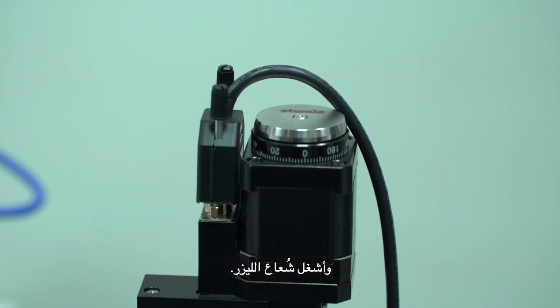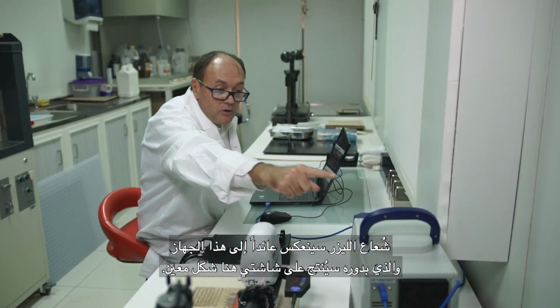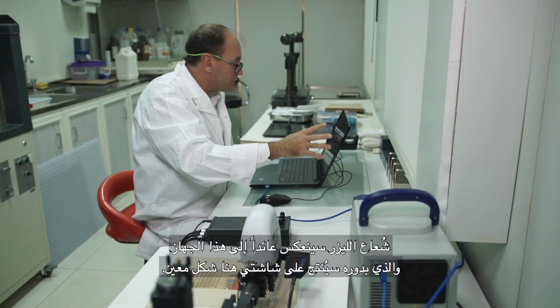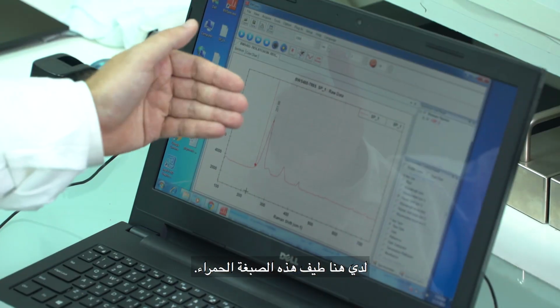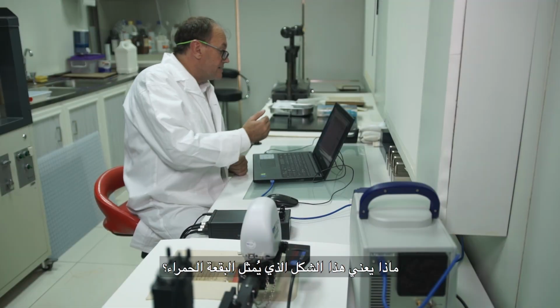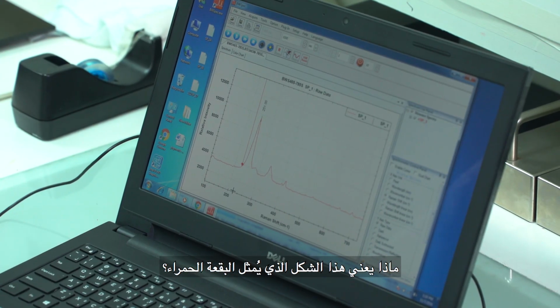So I will put my manuscript here and arrange the beam of the laser. The laser beam will go into this Raman spectrometer, which will produce on my screen a specific spectrum. So now I have a spectrum for this red. What is the specificity of this spectrum? Which red pigment does it correspond to?